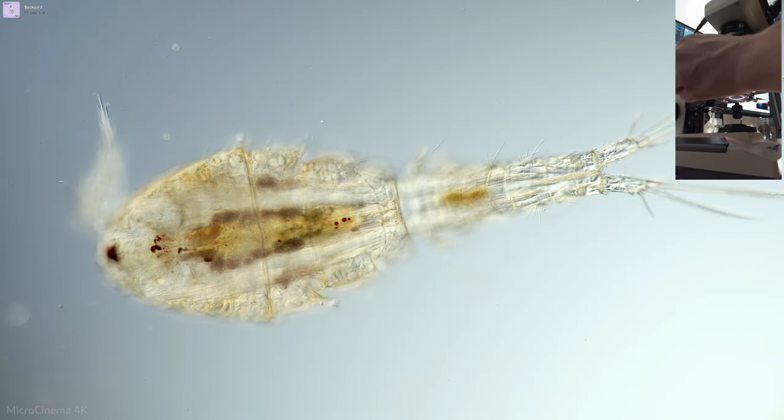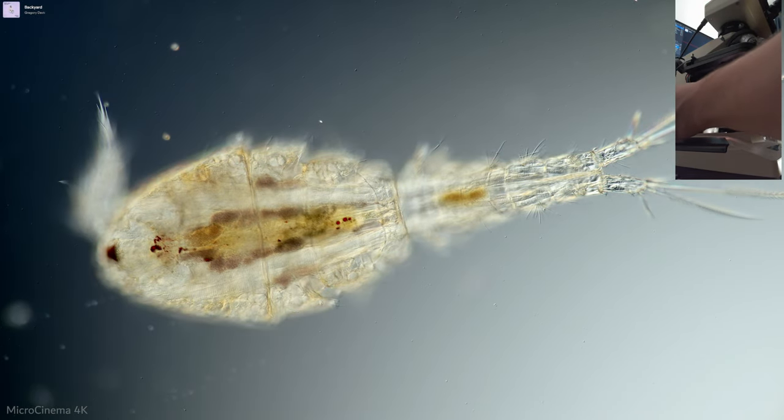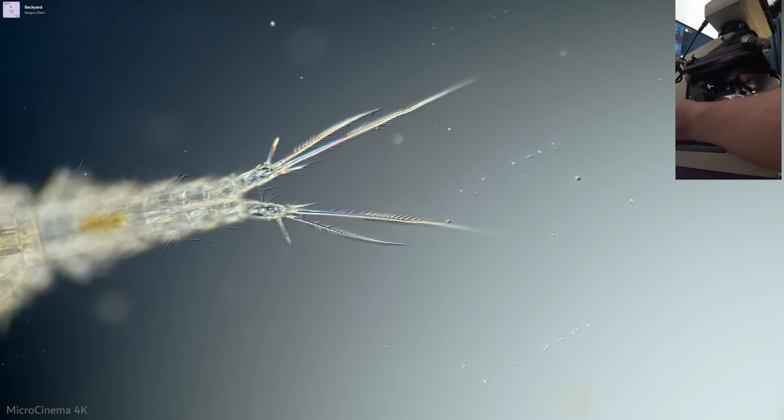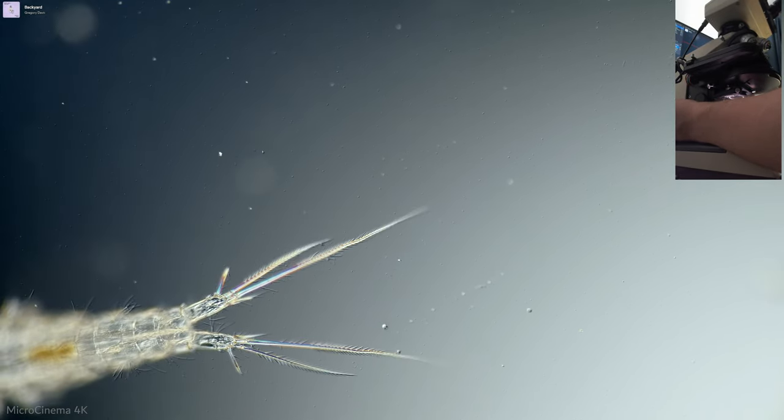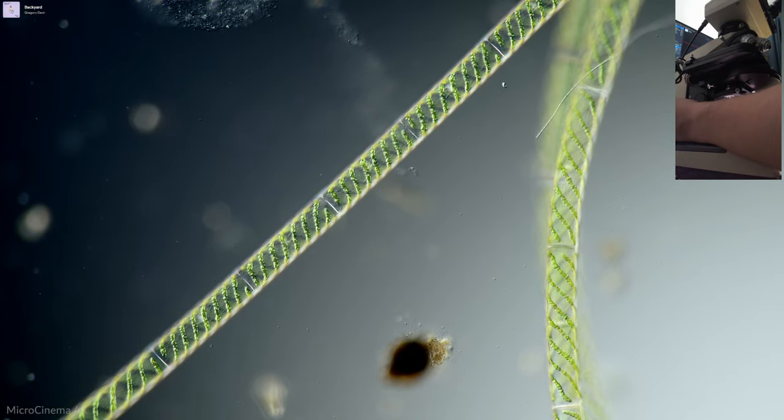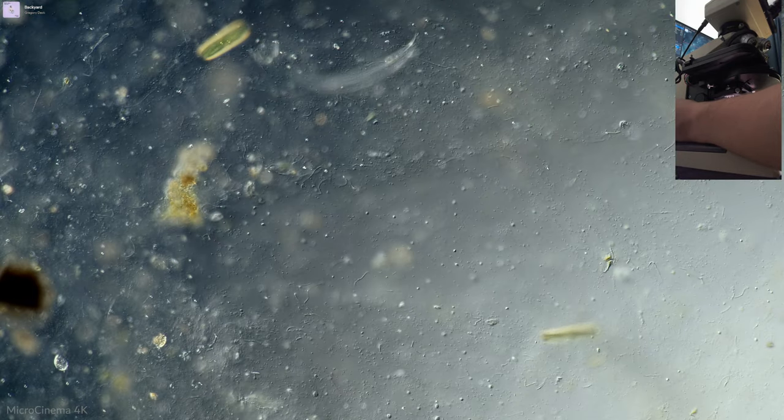And here we are getting some nice DIC imagery. And of course, since I'm using the S-plane APO objectives, I don't get quite... I actually get a very uneven feel in the background, but it really doesn't bother me at all.